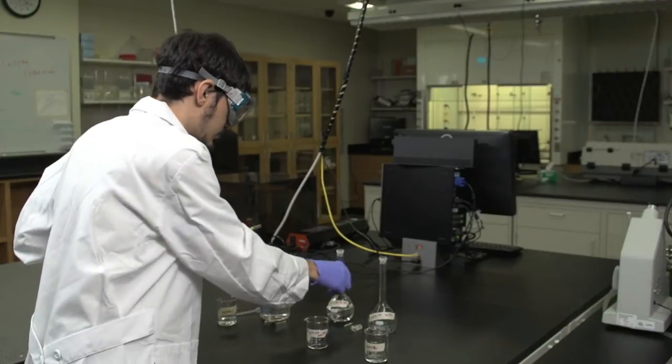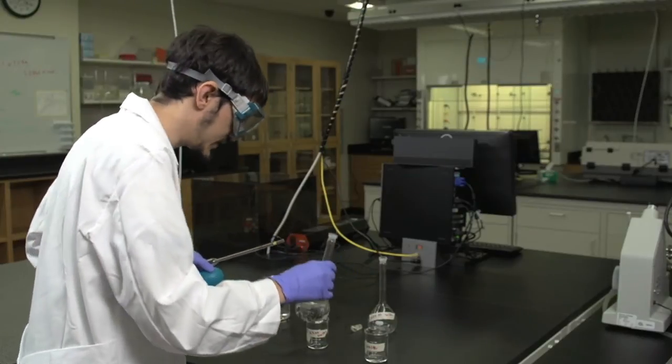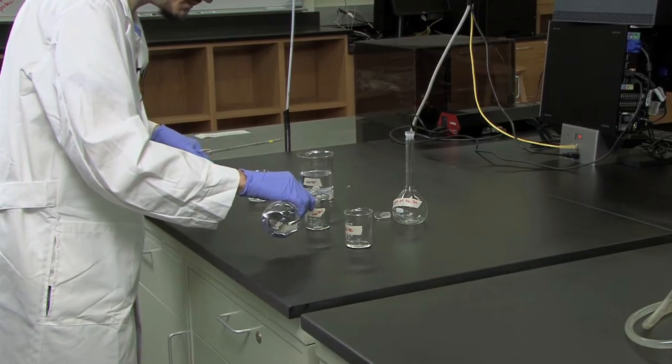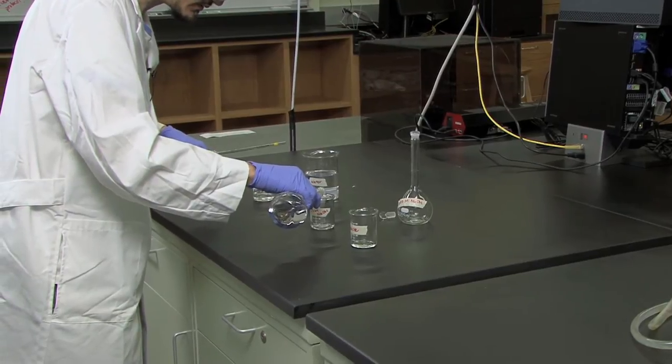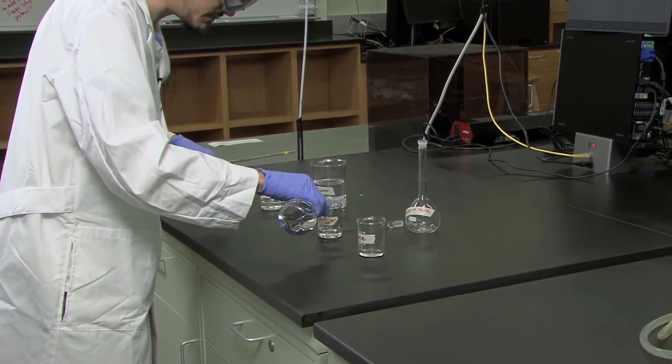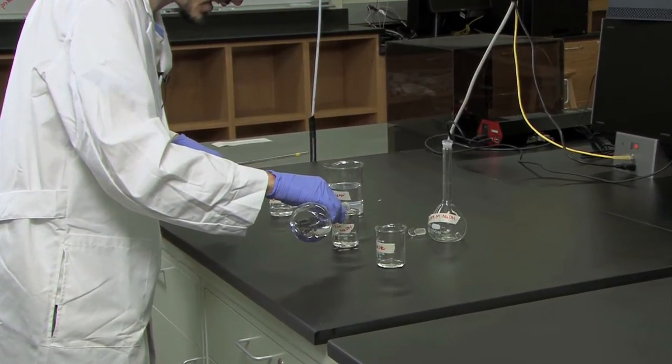Take the stock solution, or the solution from which you are going to dilute, and pour it into a separate beaker. Never pipette directly from the volumetric flask of the solution.